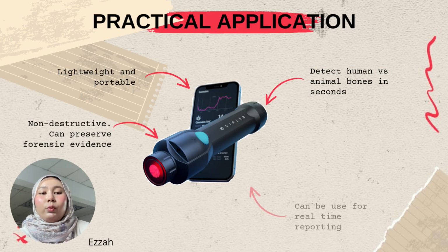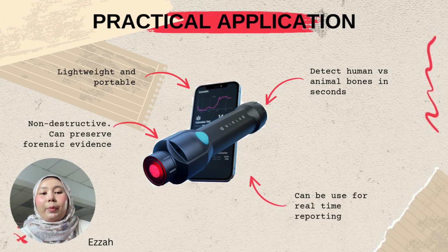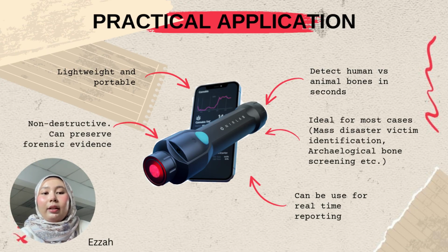So in terms of real-world practicality, this tool is especially useful in scenarios like preliminary screening during mass disasters for victim identification and supporting archaeologists for bone screening.